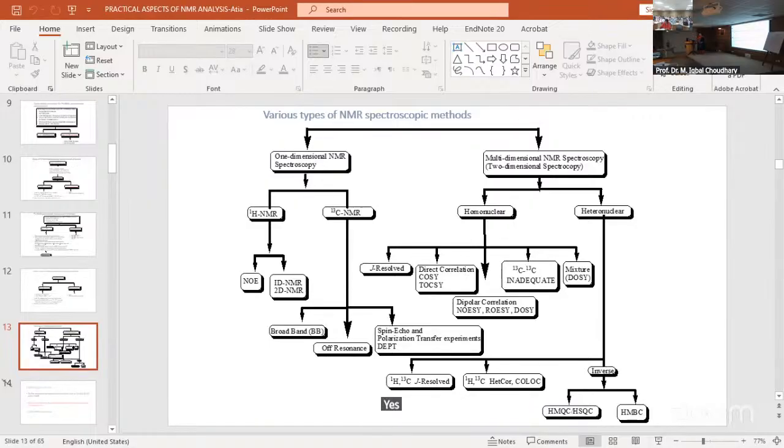Yes. Calculation of the sensitivity of carbon. I measured it and noticed that it gets 151 instead of 150 from 600 megahertz. I don't know why. I have never used Nova.